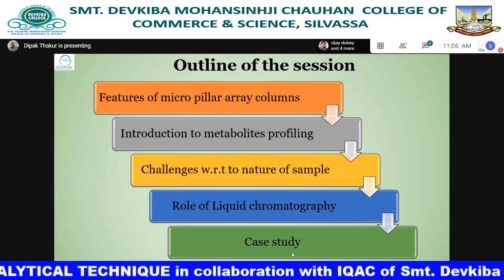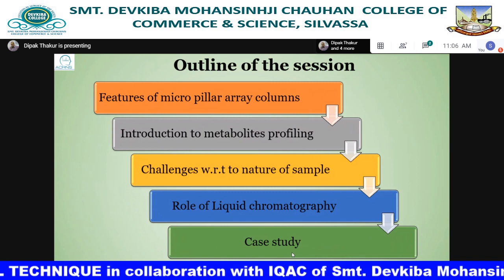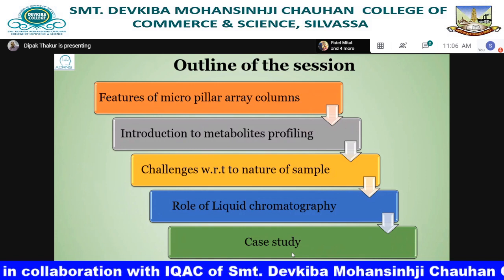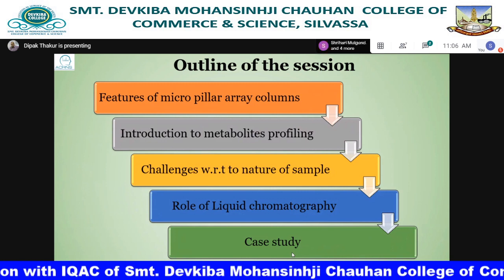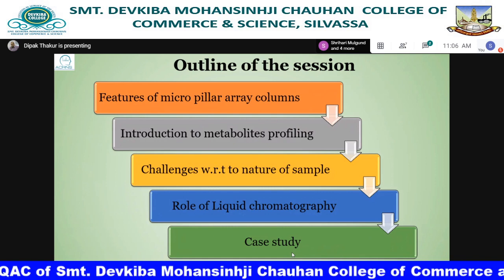And as it becomes nano, the detector used is mass spectrometry. We are going to see the benefit of nano LC connected to mass spectrometry, especially in analysis of metabolites, also in the analysis of proteomics, where it plays a great role.